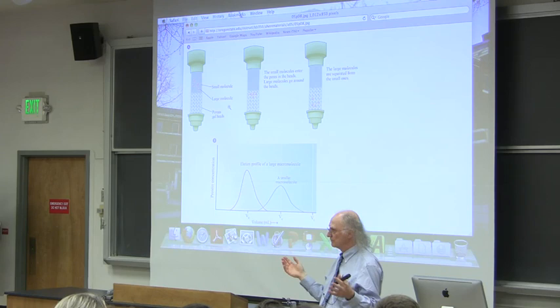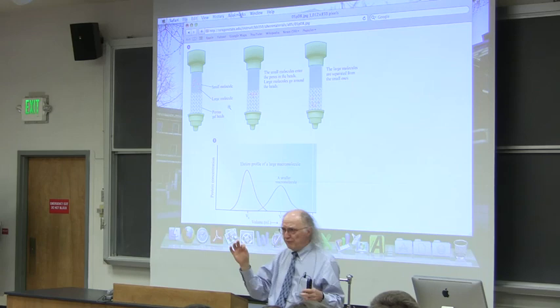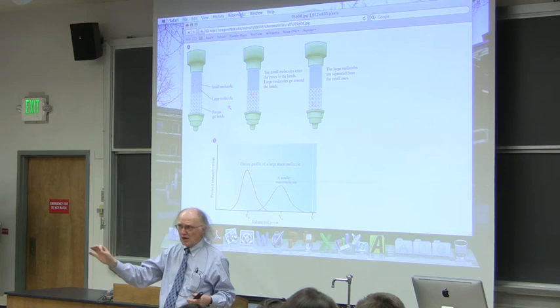The tunnels are big enough that certain molecules can fit into them. So we can imagine a very tiny protein would fit into most of the tunnels, very nicely. If we have a very big protein that's very wide, very globular, very thick, it's going to hit that bead and it's going to hit that tunnel. The tunnel won't be big enough for it to get in. So it'll just bounce off.